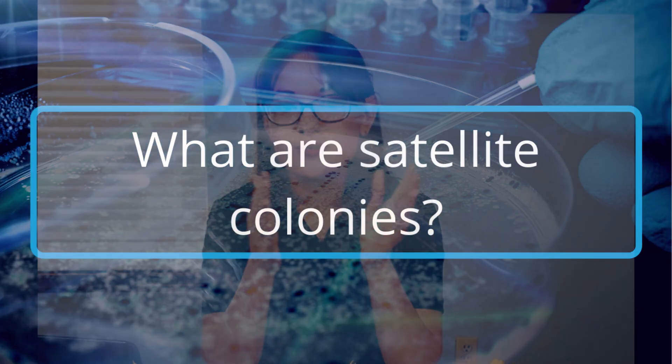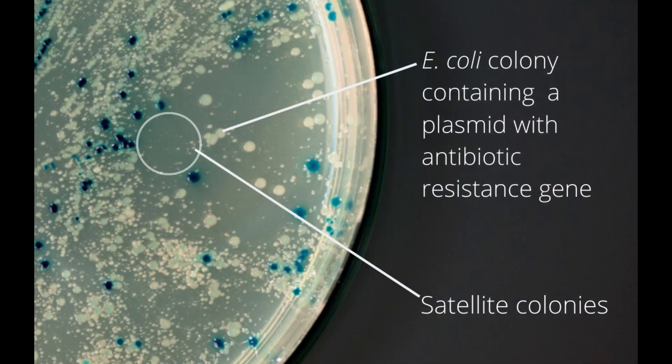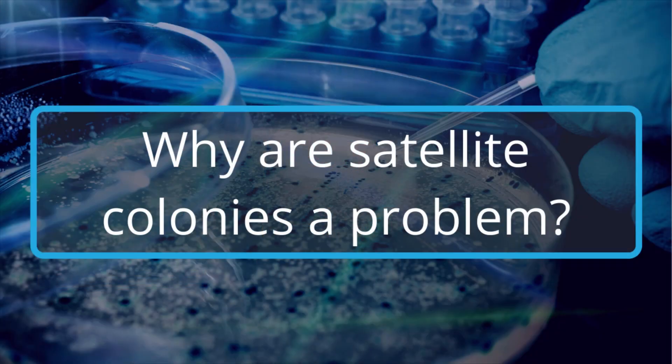So what are satellite colonies? Here is an illustration of how you'll sometimes see satellite colonies appear on your plate. Satellite colonies are these small colonies that grow up around a larger colony. The difference is that your larger colony has taken up your plasmid, but these satellite colonies have not. Satellite colonies are a common issue when doing antibiotic selection, and what makes them a problem is that these satellite colonies didn't take up your plasmid that has your resistance gene and your DNA insert.